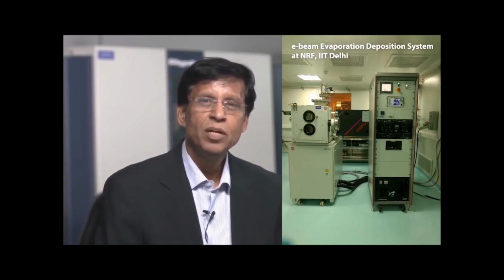The E-beam facility that we have at the nanoscale research facility is from Hind High Vacuum system, which has a Telemark E-beam gun, and this system is fully automatic, where it is possible to deposit the materials within an accuracy of 1 to 2 nanometers, and very slow deposition is possible. We can also make the deposition very fast by controlling the electron beam energy.